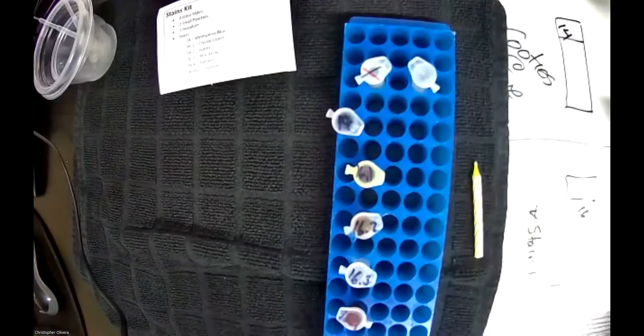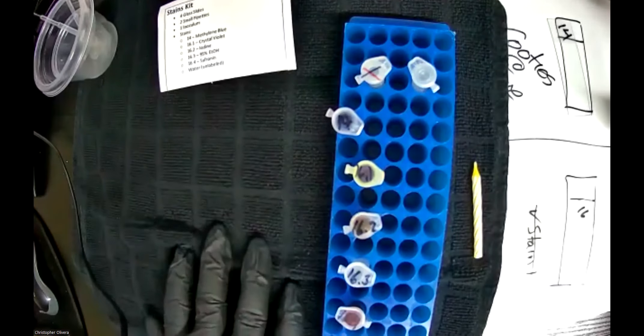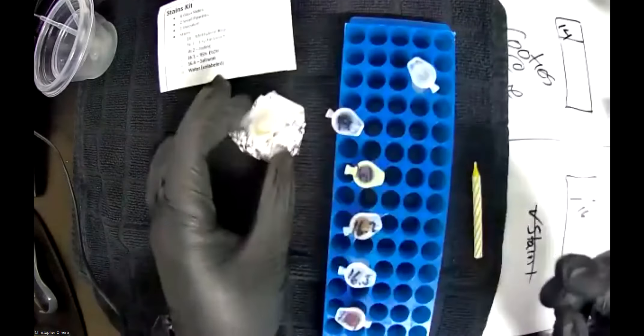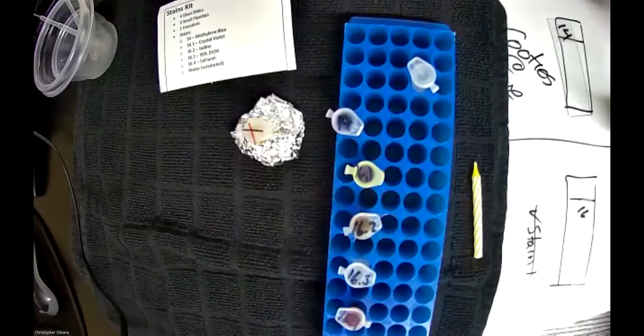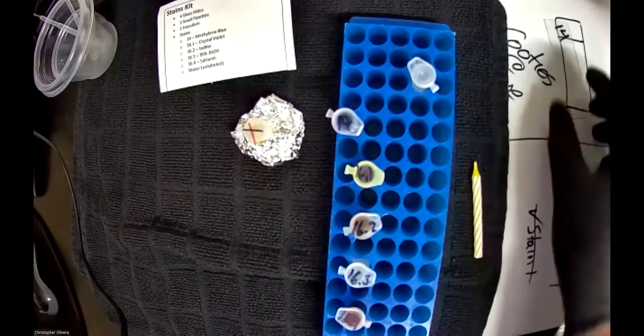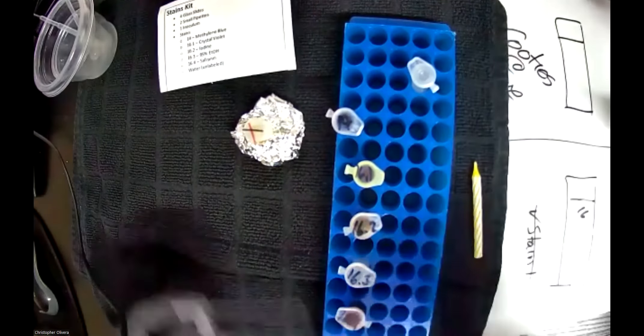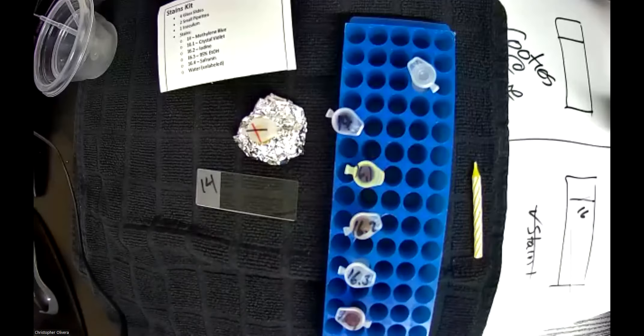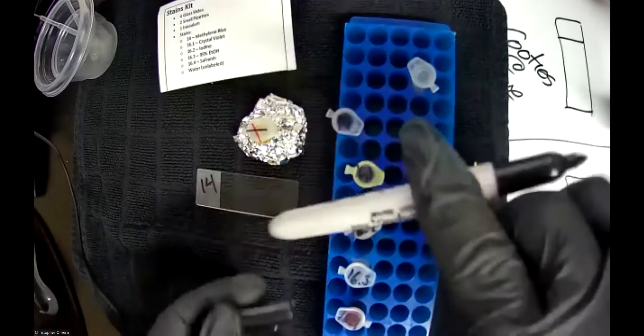Maybe you also got a vial of water — not everybody got it, this is just regular water, so get your own if you don't have one in there. Now for setup: get your sample — I'm going to use my broth because it's easier, but you can use your plate or whatever you wish — and bring your slides over and create the smears. The first thing to make your job easier is mark the slide from the back, so I'm going to grab my marker.